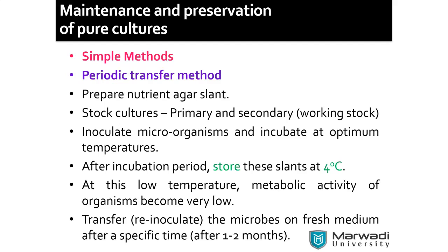If you are working on a tube, you can make a bunch. Within a small segment area, you can store it. So one is the surface area and second is the storage volume, which can be reduced while using the slant. And third advantage, it becomes easy to handle. Right? It is easy to handle, economic, and other such things are there.